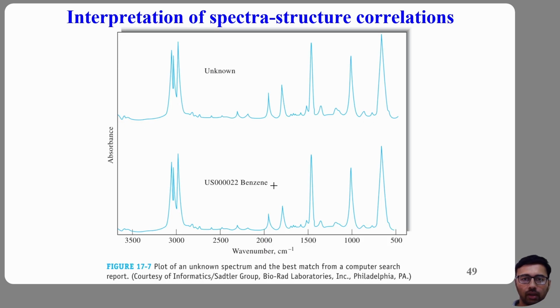Now we understand the sample preparation. Let us move into spectral interpretation. Once you run the experiment, you obtain an infrared spectrum. The question becomes, how do we identify the molecules? One powerful approach is library matching.